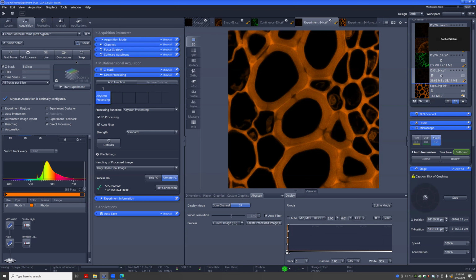If it has to talk to a different networking port, that means we have to do some Windows stuff, because the two computers talking to each other is mostly Windows based. It doesn't have that much to do with Zen. Zen can talk to the other Zen only because the two computers can talk to each other through Windows. And Windows likes to do updates and other things.